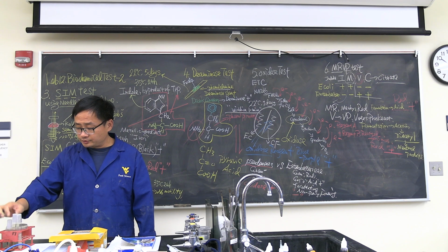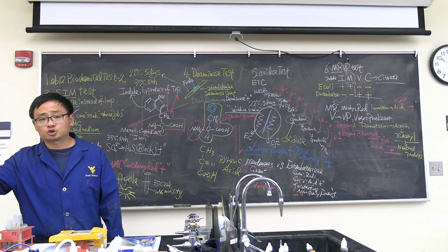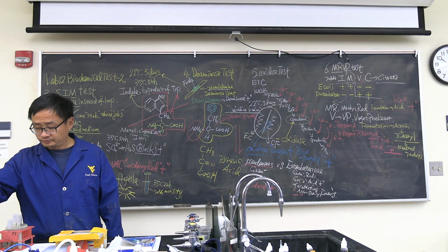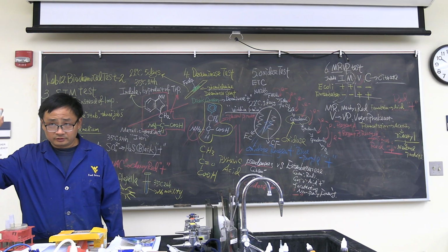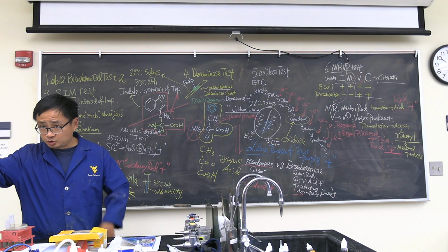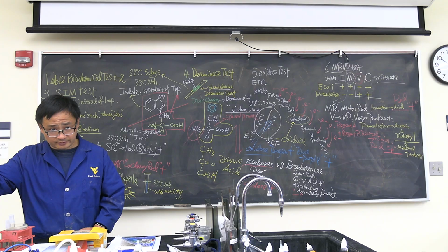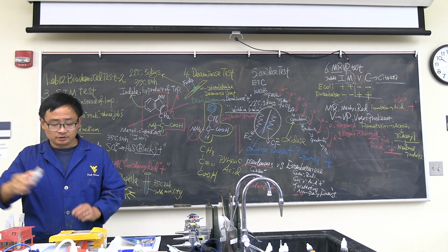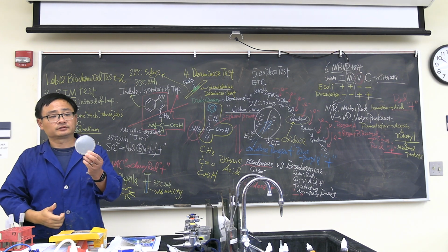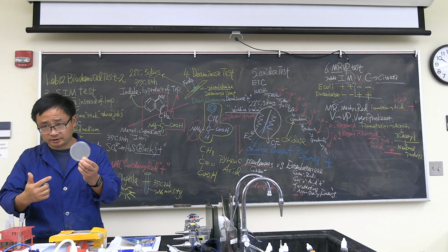What are you going to inoculate? If you inoculate E. coli, your bench partner inoculates Citrobacter. Okay? That's for the SIM test. Deaminase test. Streak onto the agars. If you inoculate E. coli, your bench partner inoculates Citrobacter. Oxidase test. You need to spot it down at the back. You do E. coli. Your bench partner does Citrobacter. Don't forget the label.